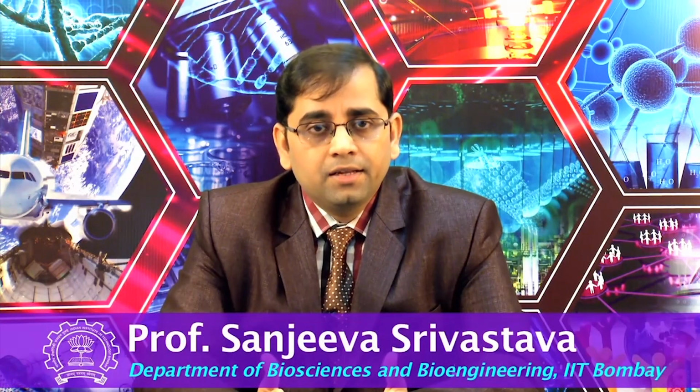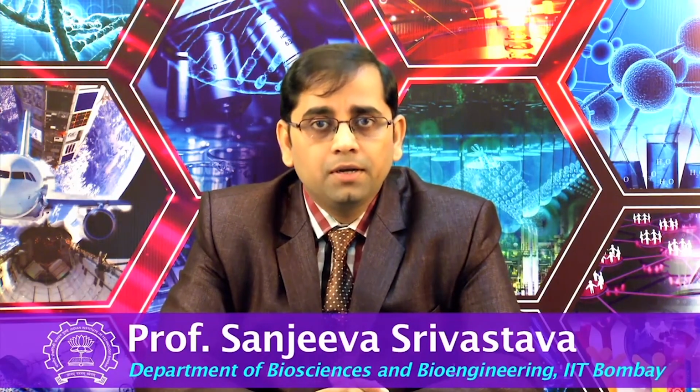I must say that one limitation is our computing power, the way we can process the big data simultaneously for a large number of samples, as well as different types of information obtained at the gene level, the protein level or the mRNA level, and trying to correlate all that information together. We really need high computing power and a lot of space to do these kinds of analysis. So the next step is to do variant analysis, which can also be done using a cloud-based tool, and I am sure as we go along in the next lectures you will specifically study how to use this data for more application orientation, especially in the context of cancer.